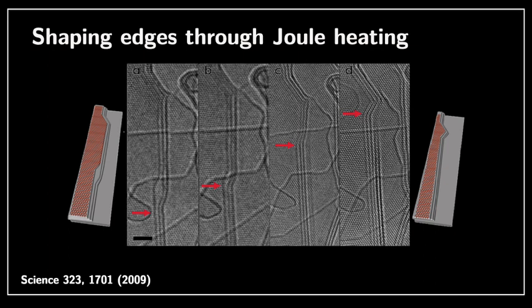So let's talk a little bit about sputtering first. Personally, my first foray in this area was this work almost 15 years ago with Millie Dresselhaus at MIT. What the experimentalists were interested in was to start from the structure on the left-hand side in panel A and see how the edges of this graphene flake could be straightened up or cleaned out, as shown in the red cartoons on the leftmost and rightmost part of this picture.